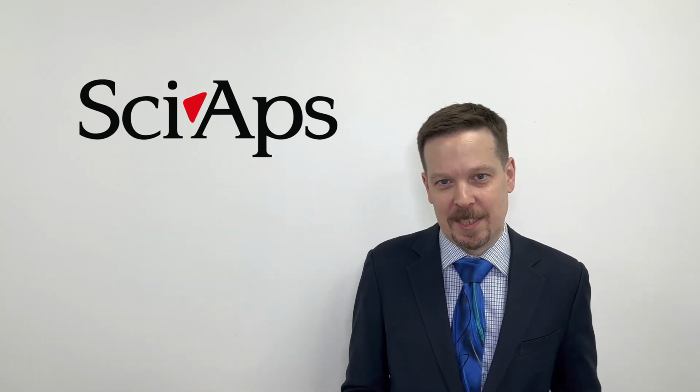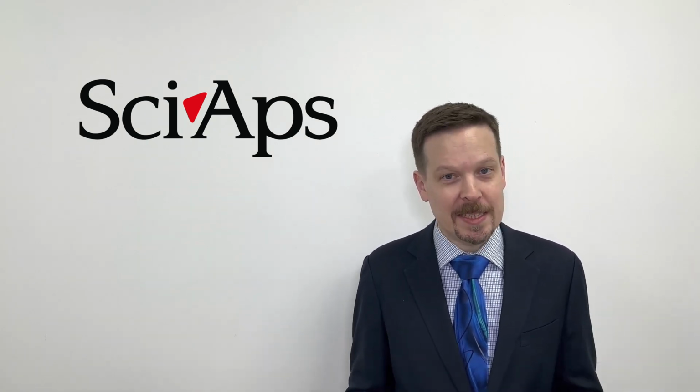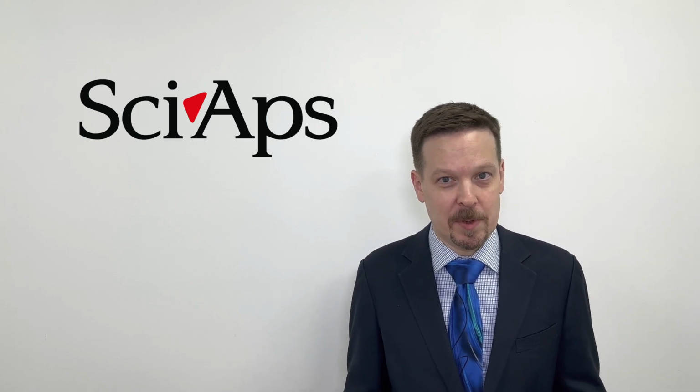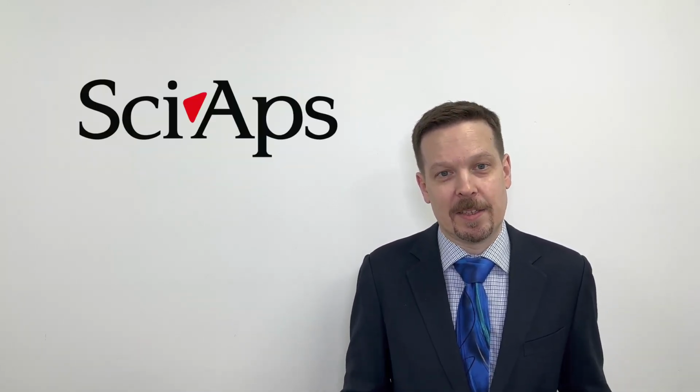There are three aspects to TMA. The first aspect is quantitative analysis. And you can do this by testing the carbon on small samples like screws. In this photo right here, you can also test inclusions and look at components to see the makeup of a very fine-tuned area for analysis.